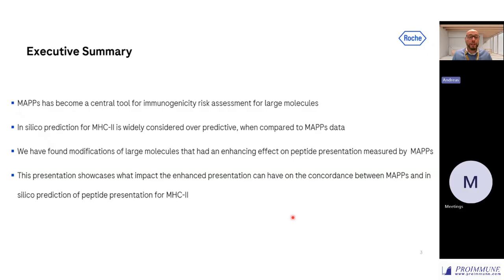However, we have recently found some particular modifications of large molecules that had an enhancing effect on peptide presentation that could be measured by MAPS. And here I would like to showcase the impact of this enhanced presentation on the concordance between MAPS and in silico prediction for class 2 presentation.